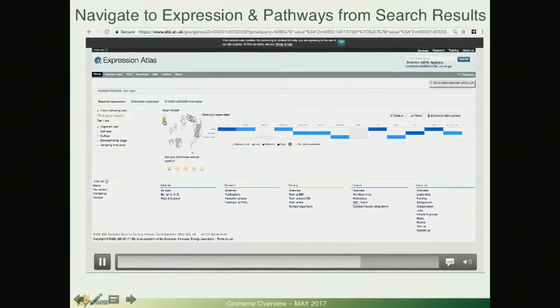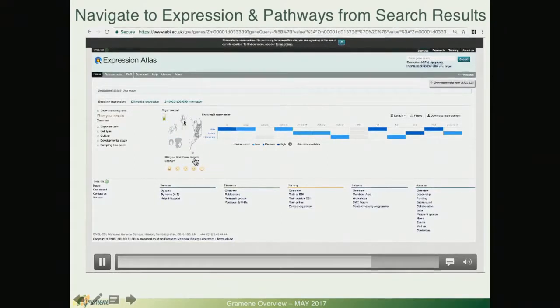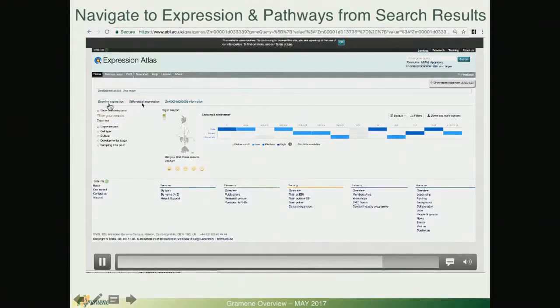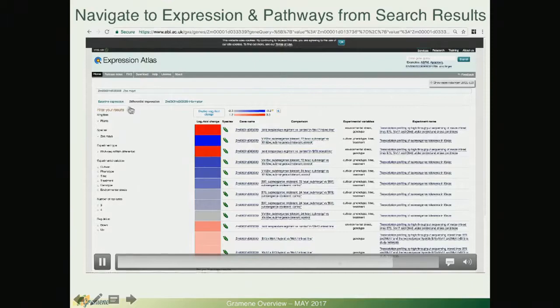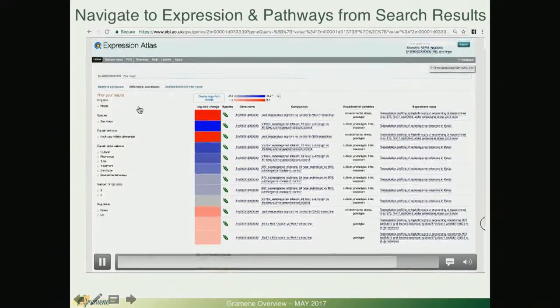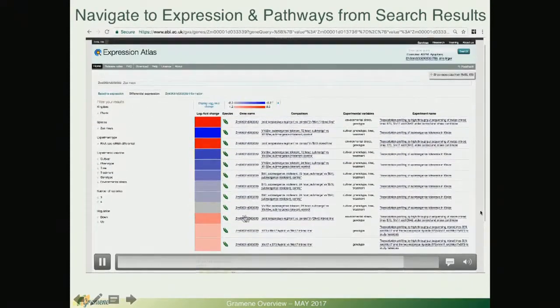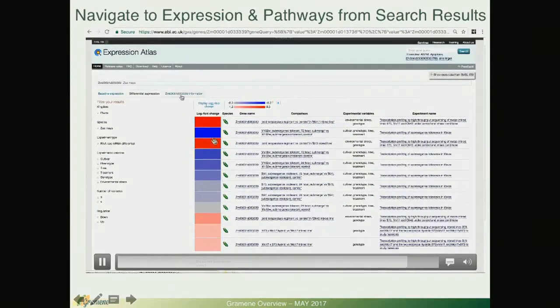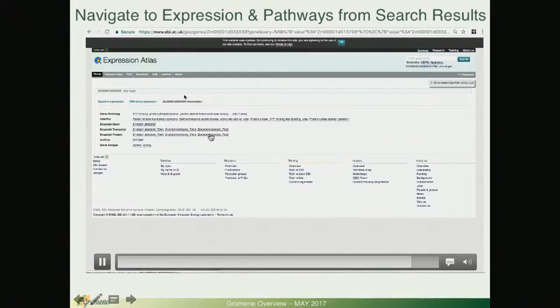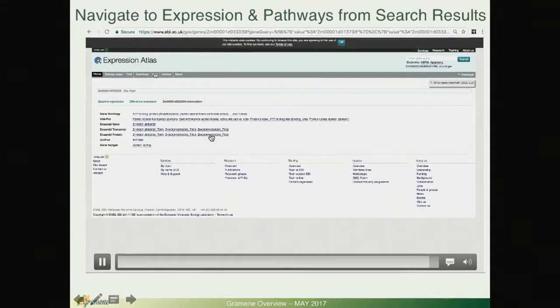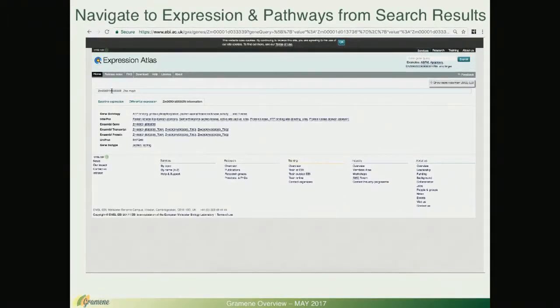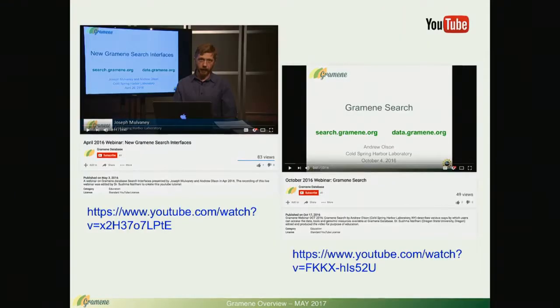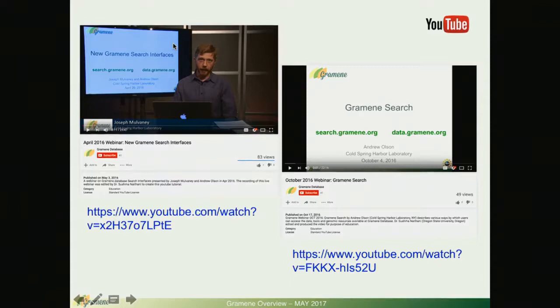You can see the exact same information for baseline expression and in addition you will find differential expression in there that you can project in turn to the Ensemble and Grameen browsers. This was covered in a recent webinar that I'm going to show you in a minute.